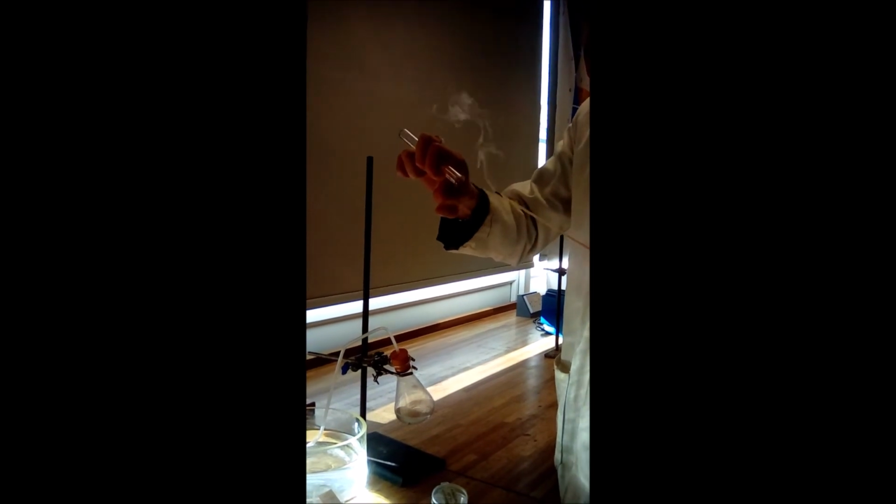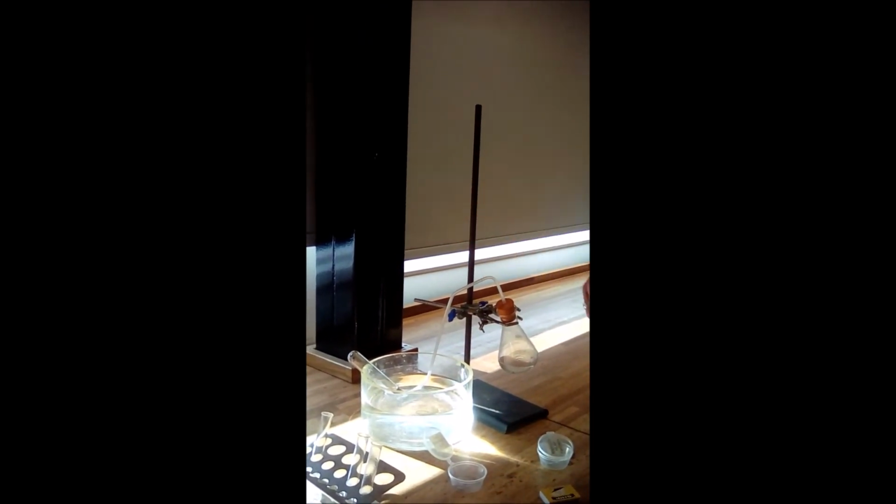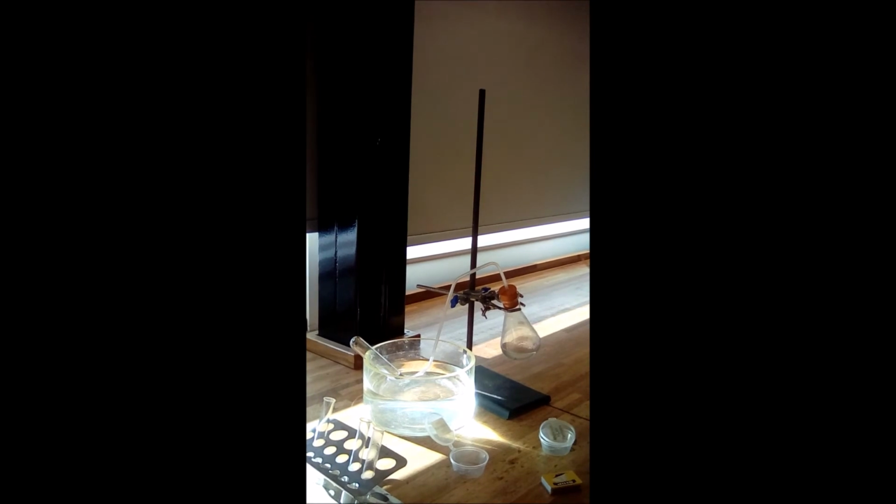Perfect. Right, splint, that's a lit splint. And then I'm going to insert the splint and see whether we've got hydrogen inside. There we go. So that is the Squeaky Pop Test. And as you can see, this experiment is still slowly but surely filling with hydrogen, but I'm too lazy to wait, so that's a much easier experiment for hydrogen.